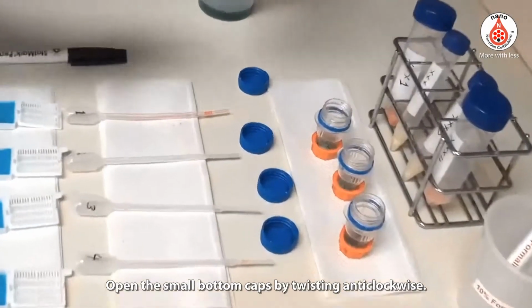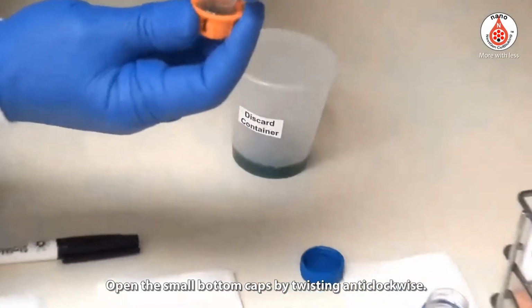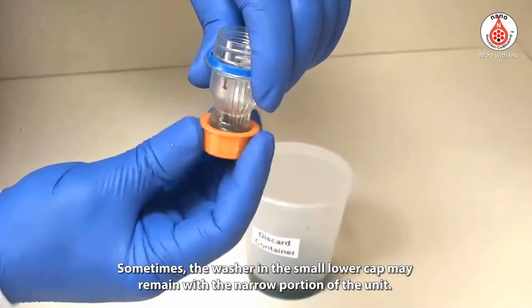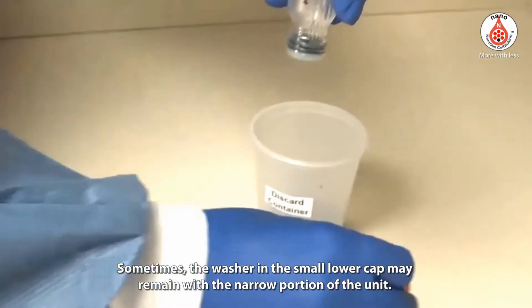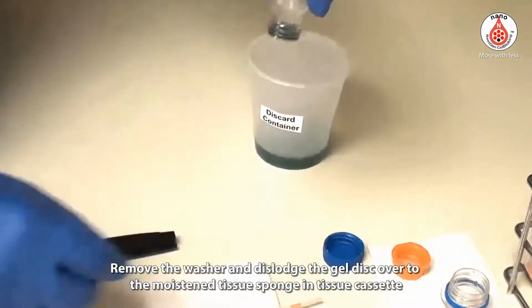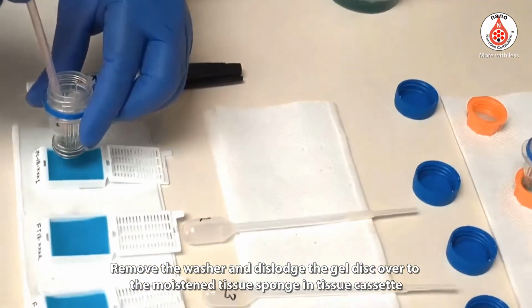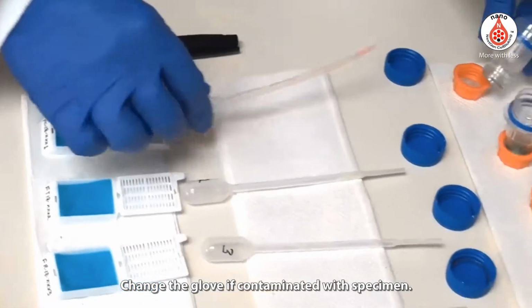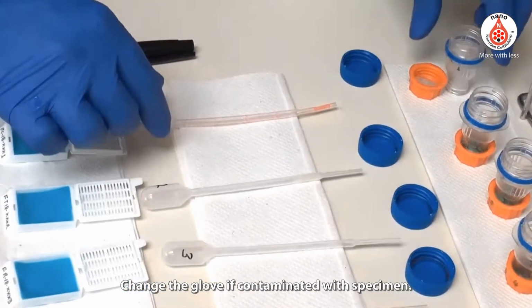Open the small bottom caps by twisting anti-clockwise. Sometimes, the washer in the small lower cap may remain with the narrow portion of the unit. Remove the washer and dislodge the gel disc onto the moistened tissue sponge in the tissue cassette by pushing with the tip of the respectively labeled pipette. Change the glove if contaminated with specimen.